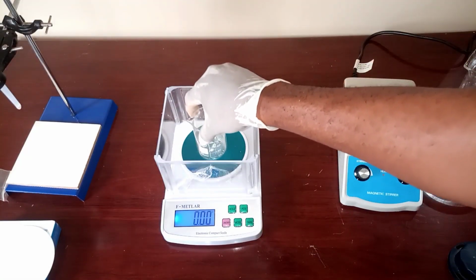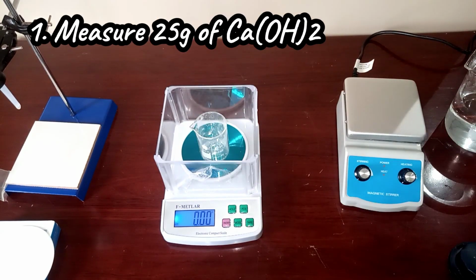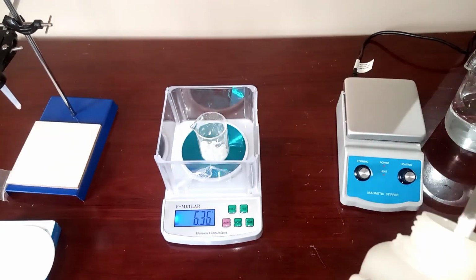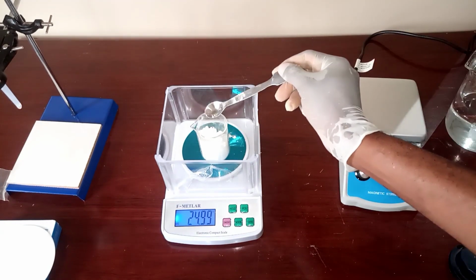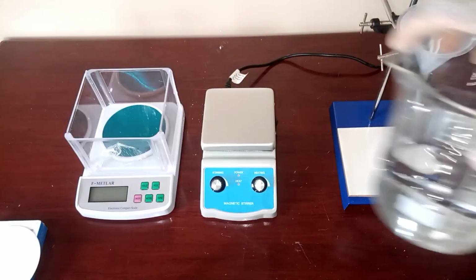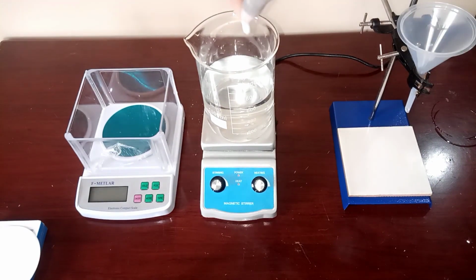So we'll start first by weighing out 25 grams of calcium hydroxide. And here we go, this is the 25 grams of calcium hydroxide. And then I'm using a magnetic stirrer here.